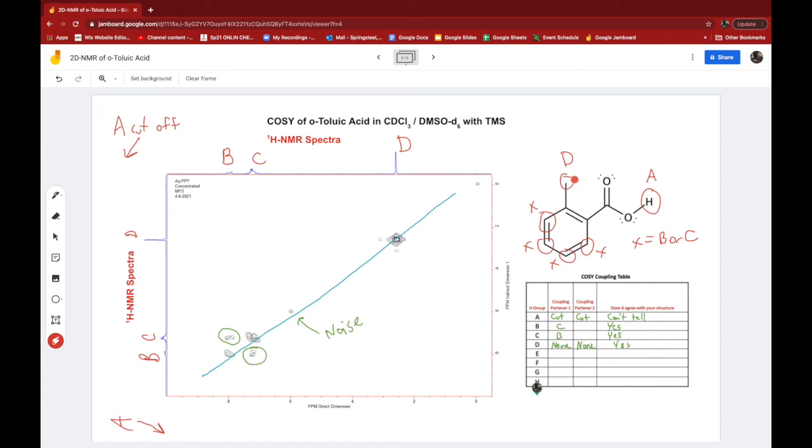Great, but I cut out the acidic hydrogen. Sad face. Does that look sad? It's confusingly sad. Put a nose in there and make it really sad. Okay. So yeah, that's it.